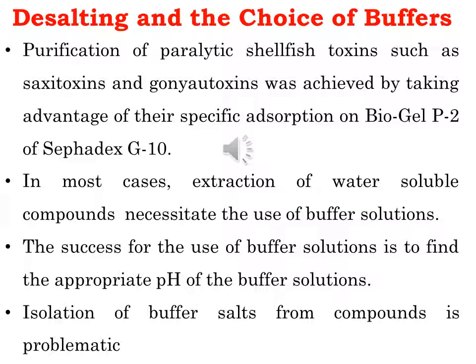They also retain a lipophilic nature and interact with the column just like alcohols. Ammonium acetate and ammonium carbonate buffers are removed by evaporation or lyophilization, but in practice these are not so easy to evaporate. The first lyophilization often results in a sticky mixture of ammonium acetate or carbonate and solutes.